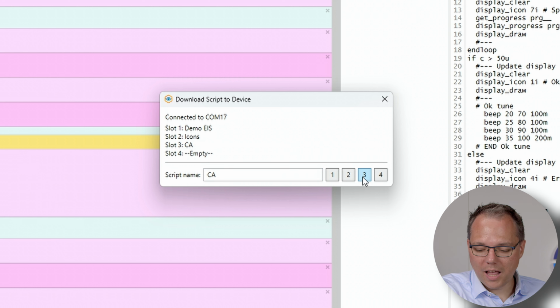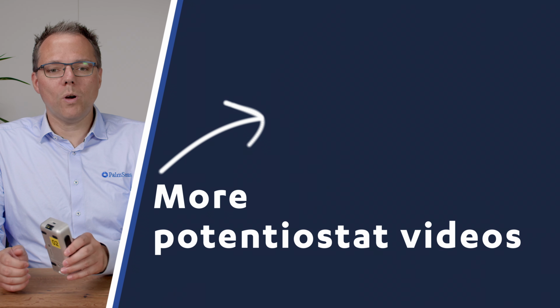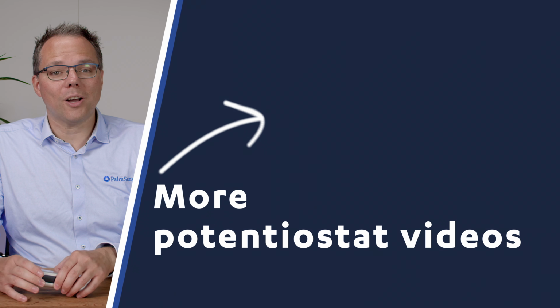As a reminder, there are 4 buttons that you can fill with individual scripts. You can do all the measurements you can do in PSTrace. You can do calculations on the EmStat4T. You can even search for peaks inside, so it can very standalone do a lot of things and show a result on the display. Videos that are coming up are how to change the looks of the touch display and what can you do with the QR code reader.